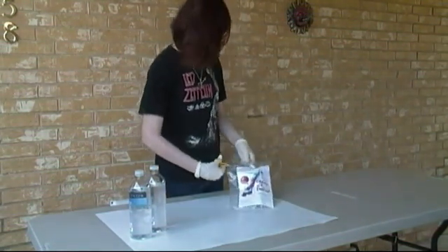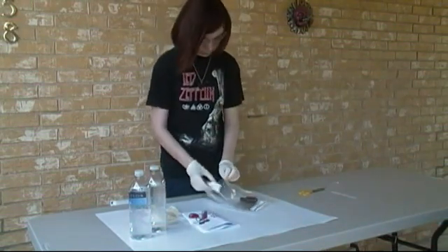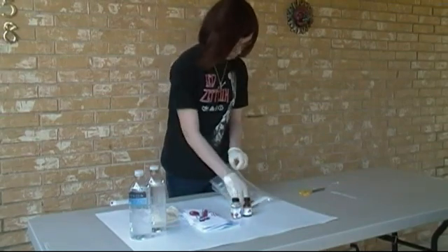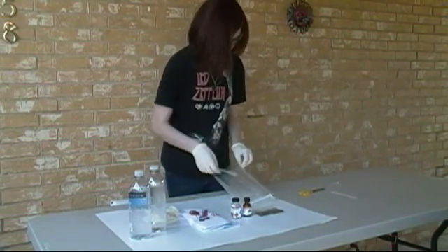If you'd like to perform this experiment, you can also purchase the kit, or you will need the following: two plastic water bottles, some sodium hydroxide, aluminum chlorohydrate, some plain old everyday dirt, and a plastic pipette.